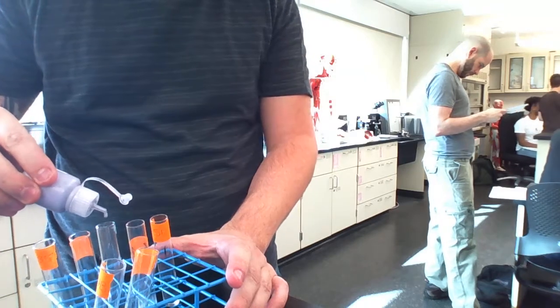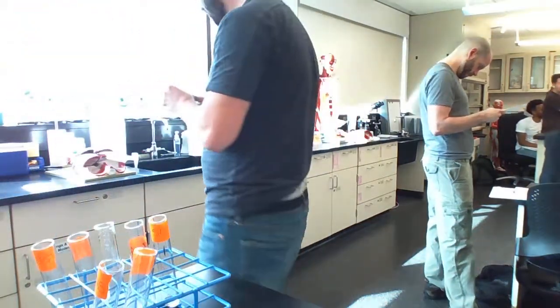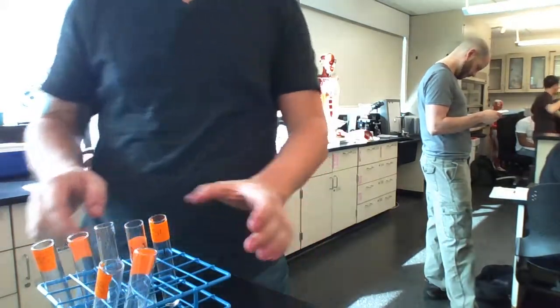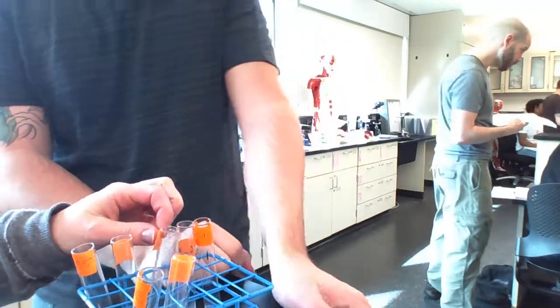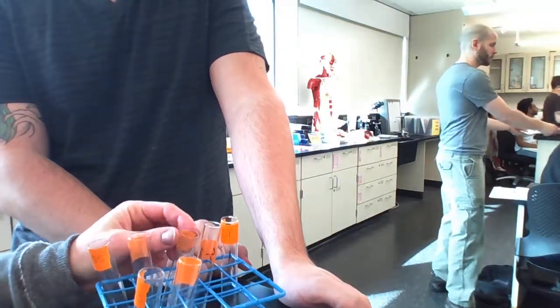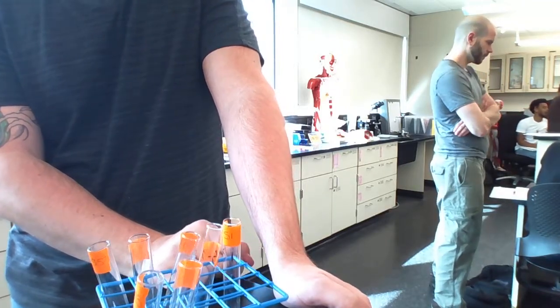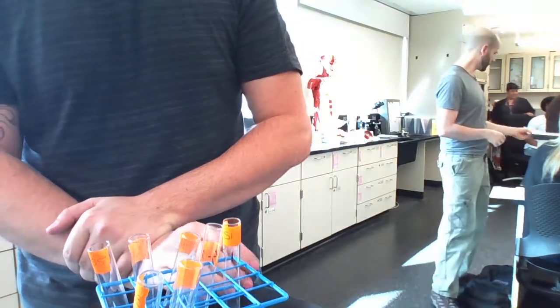So lipase is the fat enzyme, right? And then it's just mixed with water. So what I am wondering is, why isn't there vegetable oil in there? Isn't that what it's supposed to be breaking down? Oil, right? It doesn't say. Yeah, what is the actual point?